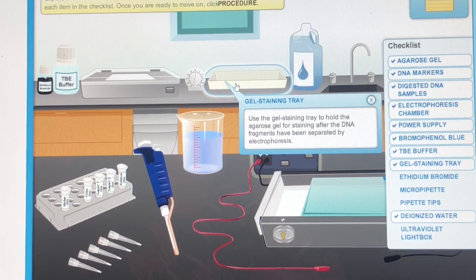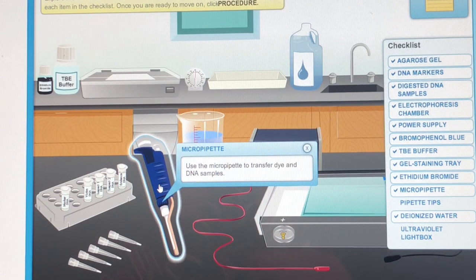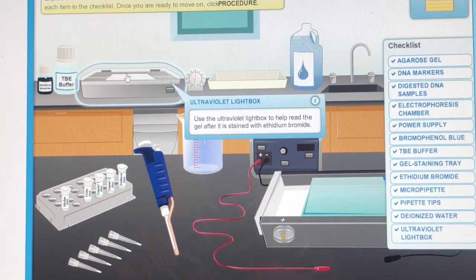Use the gel staining tray to hold the agarose gel for staining after the DNA fragments have been separated by electrophoresis. Ethidium Bromide is a fluorescent dye used for staining DNA. Use the micropipet to transfer dye and DNA samples. Use a clean pipet tip before transferring dye or DNA samples to avoid contaminating the samples. Use the ultraviolet light box to help read the gel after it is stained with ethidium bromide.